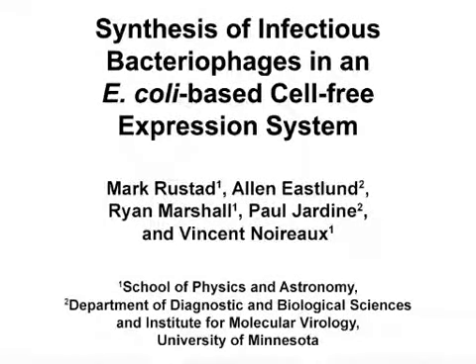The overall goal of this experiment is to describe how bacteriophages are synthesized from their genome using an all E. coli cell-free transcription-translation system. This method can help answer key questions in the synthetic biology field, such as elucidating the molecular self-assembly mechanisms in living systems.